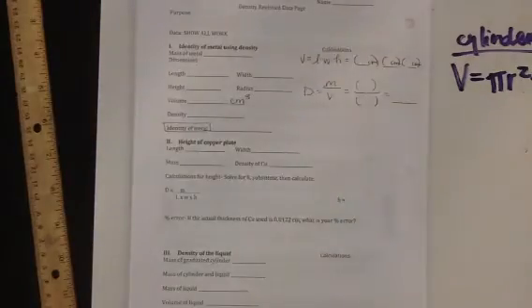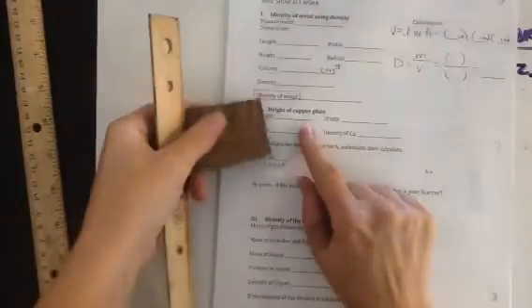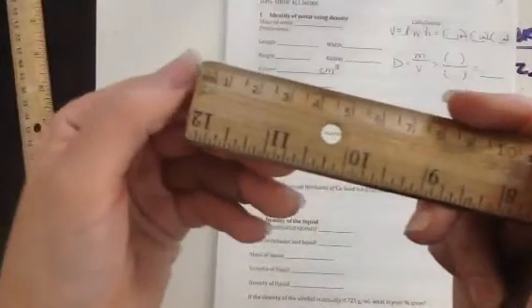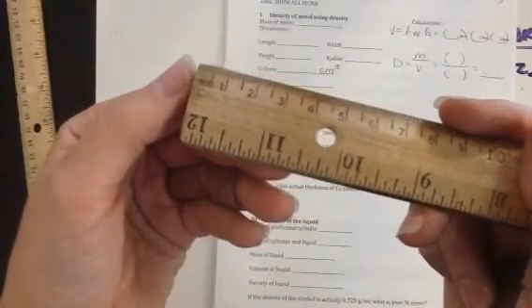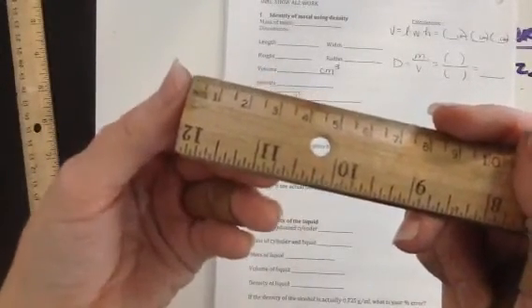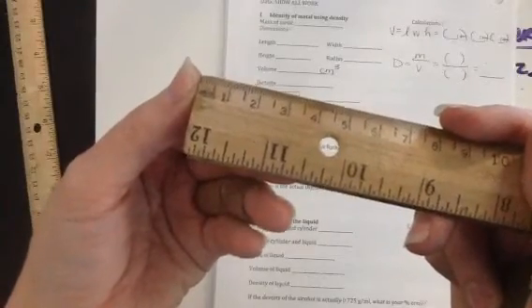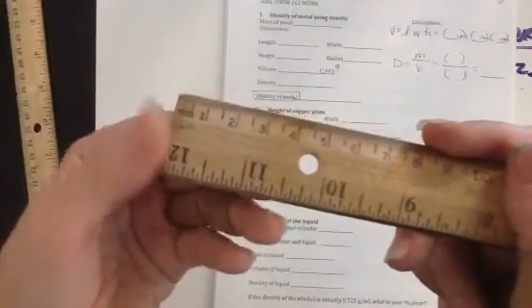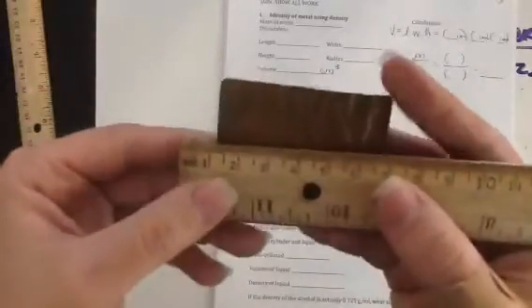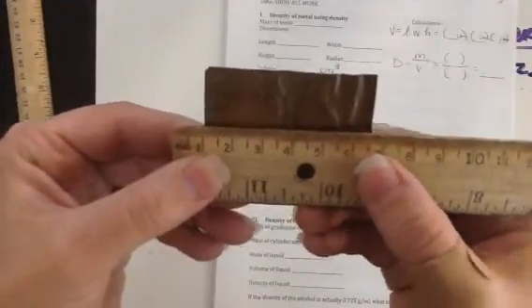So let's look at our equation down here. It asks me what's the length. Well, I can measure the length. So I use my ruler. I hold it up. Now, if you note, where's my camera? Do you see how on the end of my ruler here it's damaged? So if I make measurements directly from 0, are they going to be as accurate as possible? No. So I should start at 1 because I can clearly see where 1 is, and then subtract 1 centimeter off.